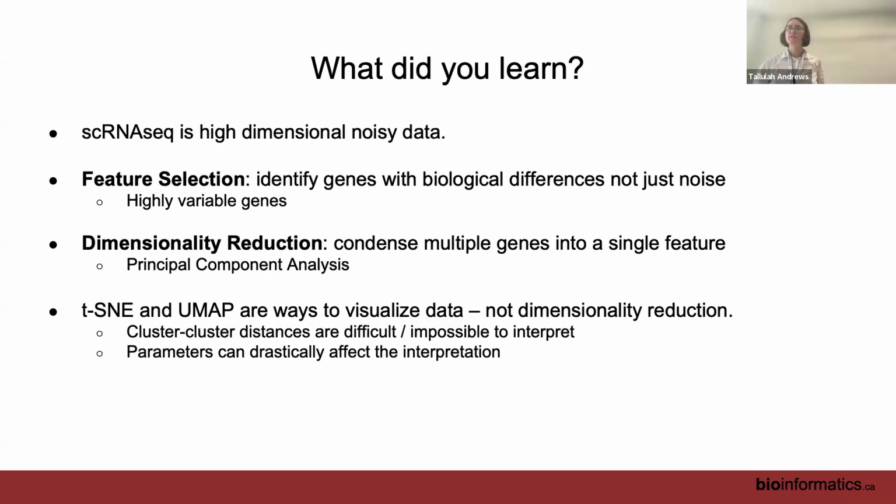Ottawa also asked, does diffusion map reduce dimensions or not? Yes, diffusion map also reduces dimensions. You specify how many dimensions you want. Usually people go for 2 or 3.